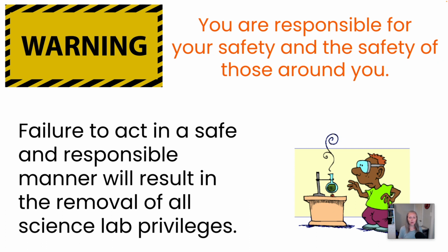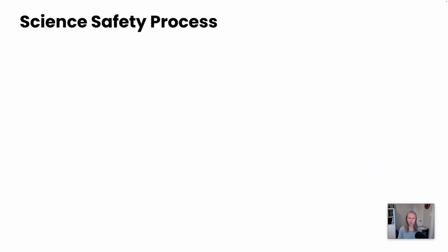Failure to act in a safe and responsible manner is going to result in the removal of all science lab privileges. This is non negotiable for me. So, we have to take this very, very seriously. Now, let's talk about the science safety process itself.